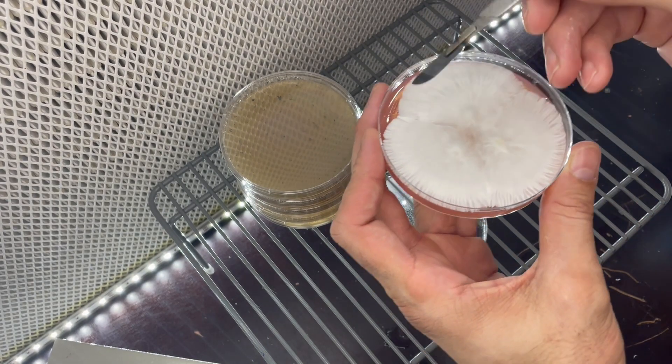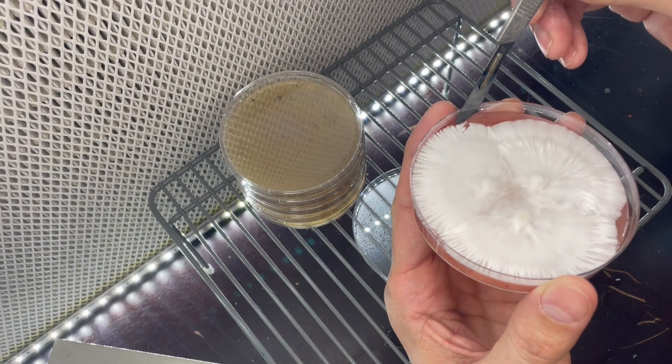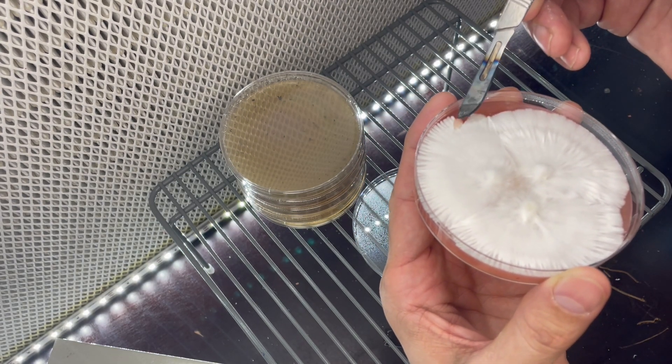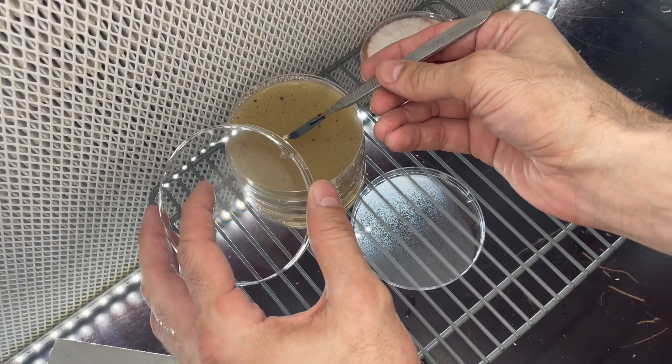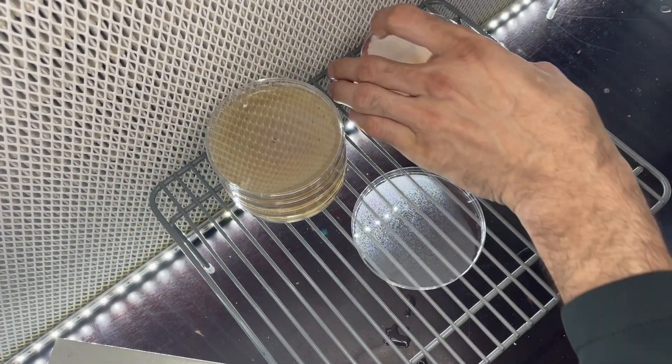Now when you're selecting growth, you want to go towards the outside, but not right on the outside rim. The reason being that's the closest chance for contamination if you're on the outside rim. So if you see I take just a little small piece, put it in.